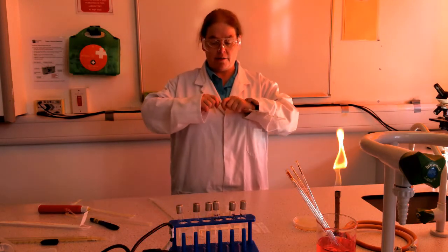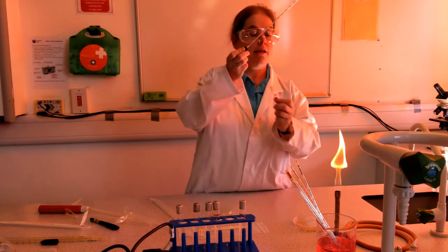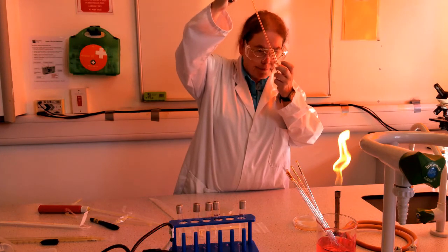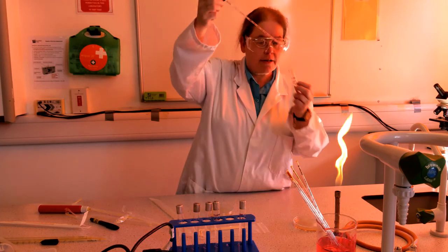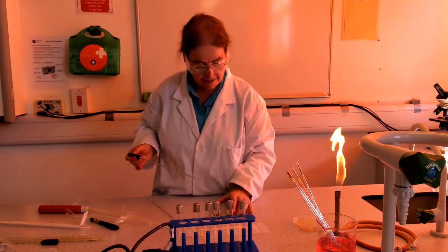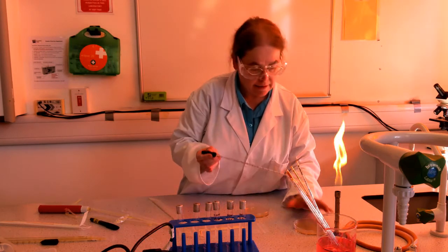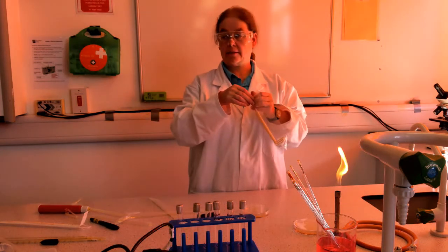So my 10,000 dilution, 0.1 millilitres, onto the 10,000 plate, and spread it with a sterile spreader.